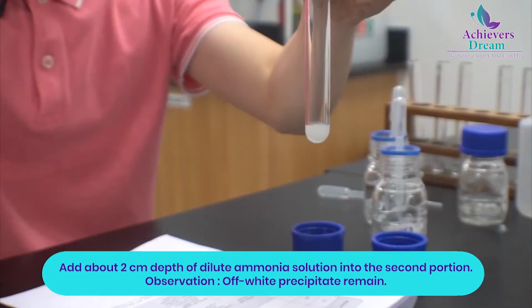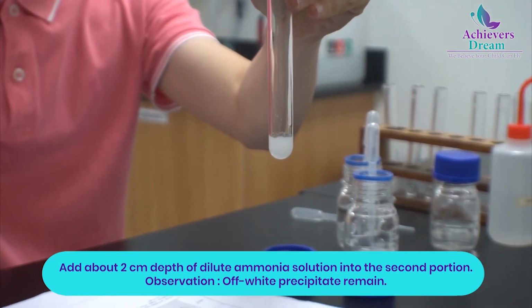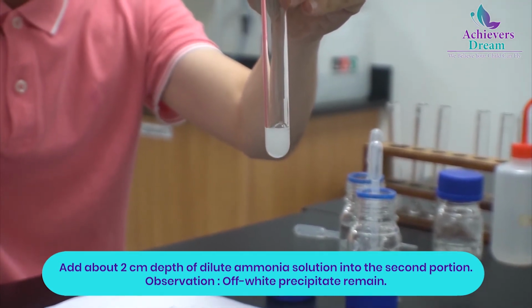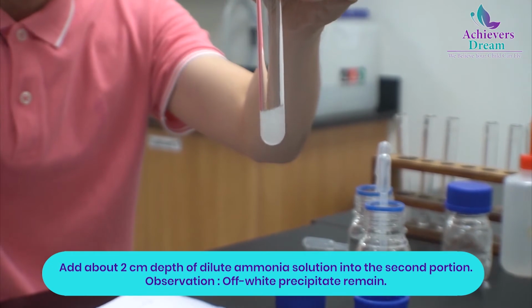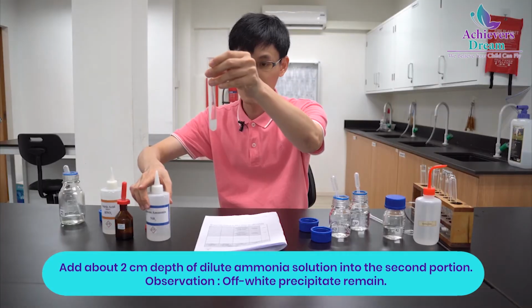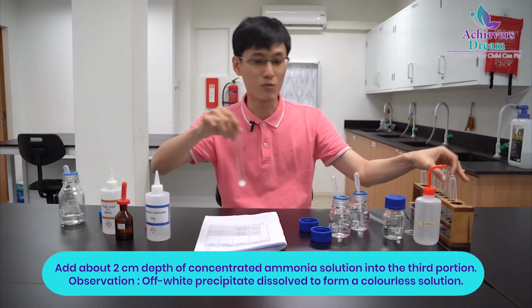Let's try. Nothing's happening. Contrast this with the chloride ion just now, where it dissolved quite rapidly. The precipitate is still there. Okay, so silver bromide is insoluble in dilute ammonia.